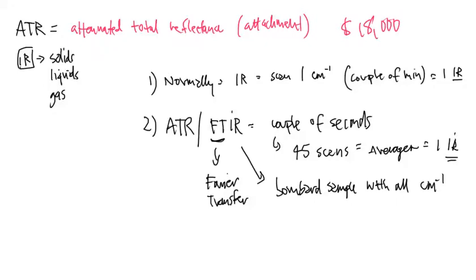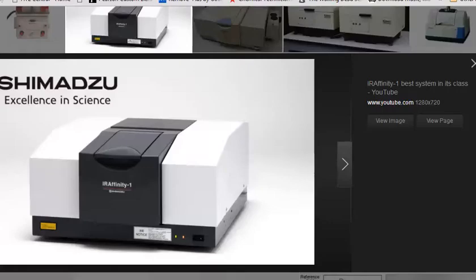Okay, so here is a picture of our infrared spectrometer. This is the normal infrared from Shimadzu that we have in our laboratory at this time. And this is the major workhorse. This is the one that we go to most often because it's the most current and the most relevant that we have at least. All right, well, traditionally what would happen is that this lid would open up and then I would put a salt crystal down into the infrared and then I would close the lid back and I would scan the sample and produce an infrared spectrum.